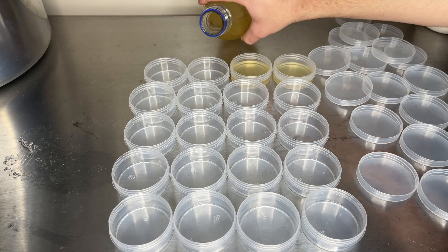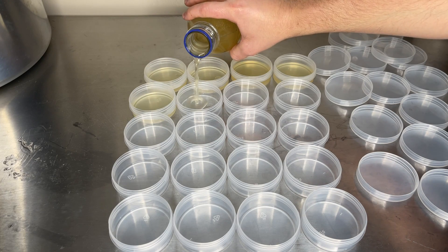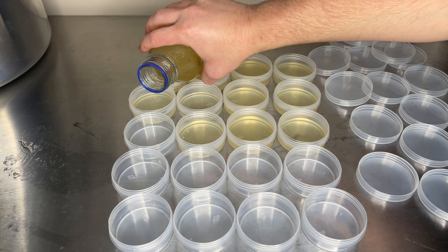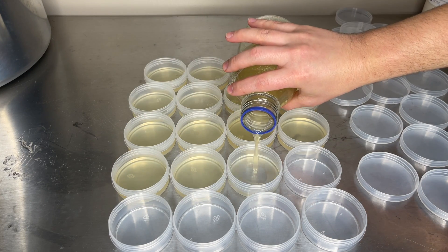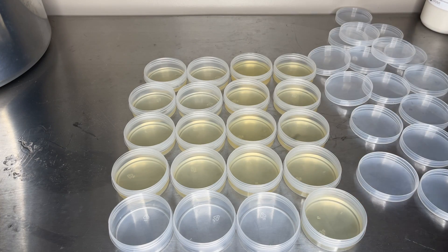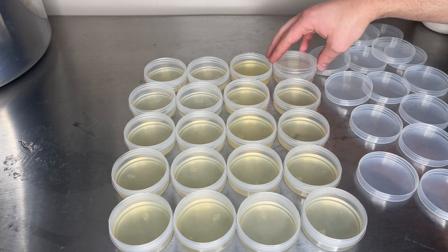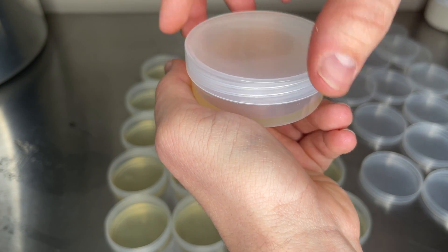500 milliliters is more than enough to fill 20 of these containers. After all the containers are filled, the lids are attached, tightened, and then slightly loosened.